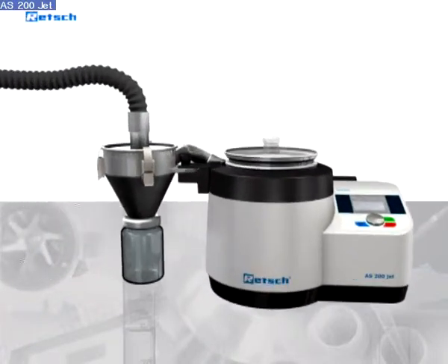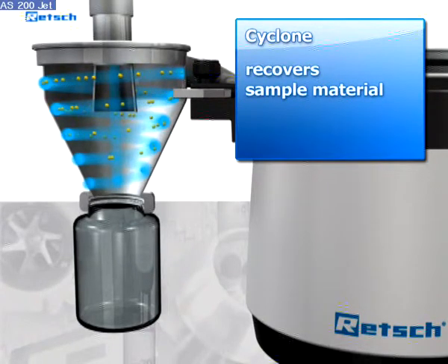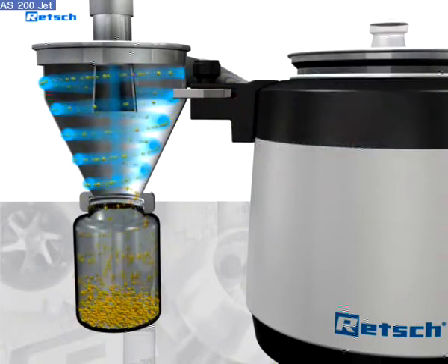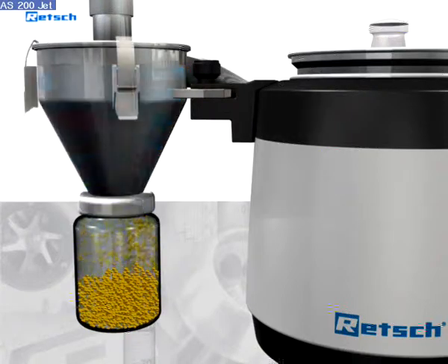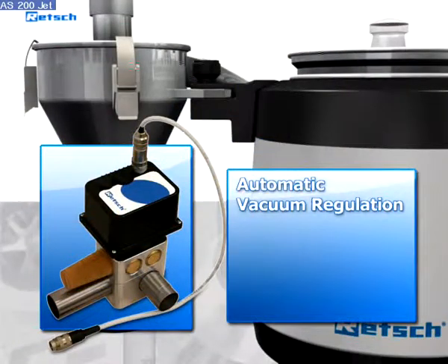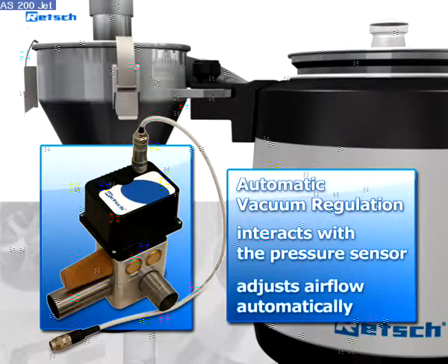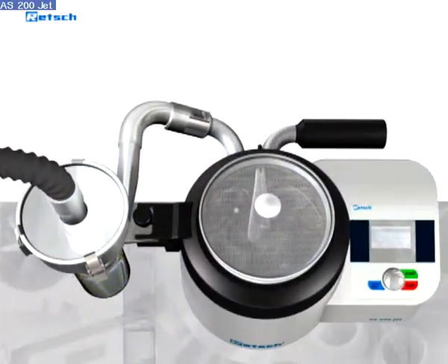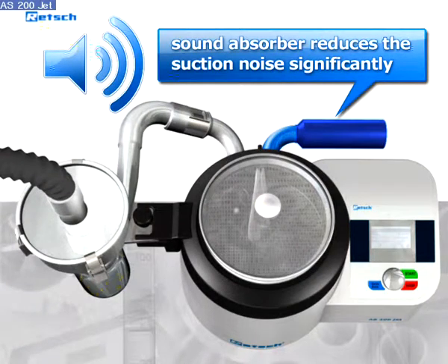The AS200 Jet offers a range of useful accessories. If the measured sample material is needed for further analysis, it can be recovered with the help of the optionally available cyclone. It also helps to avoid blockage of the vacuum cleaner filter with fine particles. An automatic vacuum regulation can be connected to the device, which interacts with the pressure sensor, automatically adjusting the airflow to the entered value during the whole sieving process. The supplied sound absorber can be connected to the air inlet channel, which reduces the suction noise significantly.